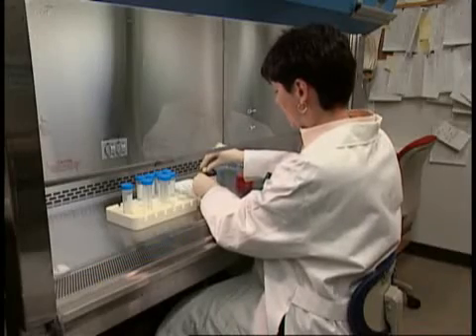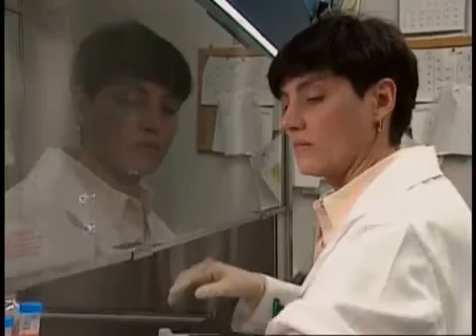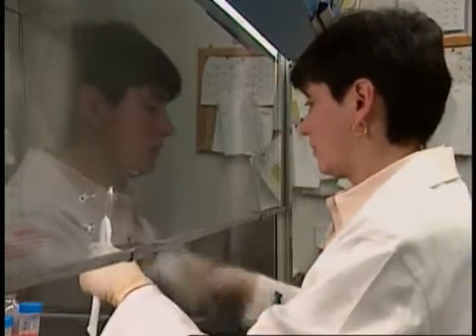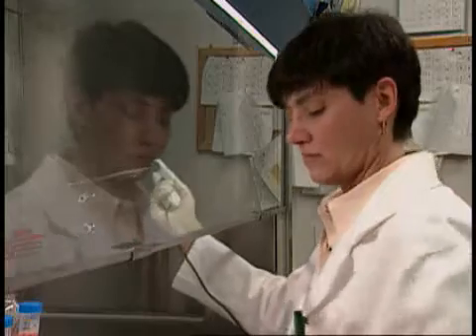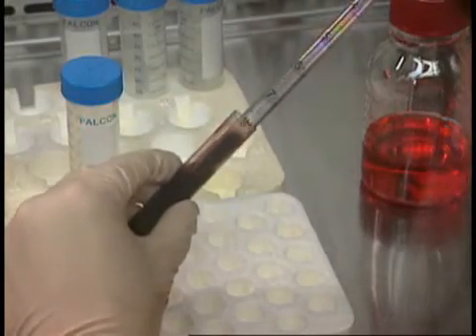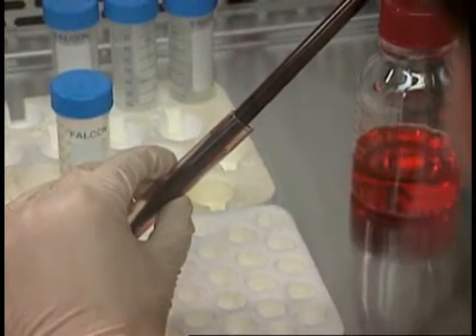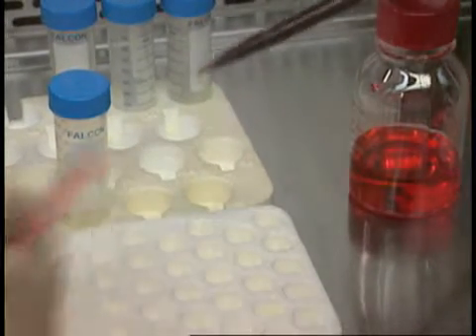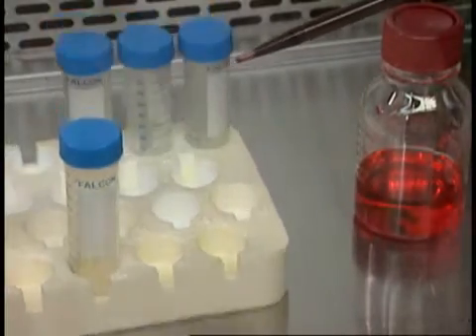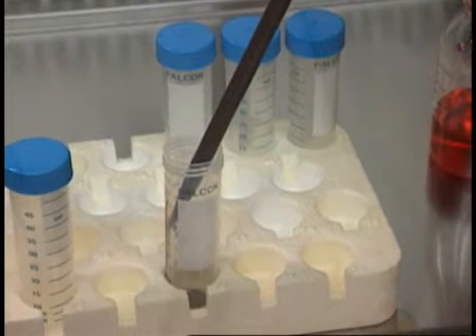Dr. Christine Cricket Seidman is processing blood in order to establish a new lymphocyte cell line. She is seeking to identify the defects in the genes responsible for causing familial hypertrophic cardiomyopathy, a disease which causes death in young athletes. She obtains her blood samples from all over the world and knows they run the risk of being contaminated with HIV, hepatitis B virus, hepatitis C virus, or other bloodborne pathogens.